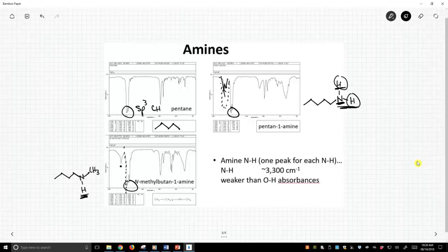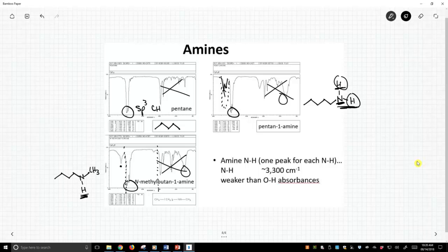You might say, hey, what's going on down here? Look, we have stuff. Yes, we do, but remember that is below 1,500 wave numbers, and we're not going to try to interpret that part of the spectrum. So only stuff that has a value greater than 1,500 wave numbers will we concern ourselves with in this class. So those are two more functional groups, common functional groups that we will see, amines and alcohols.